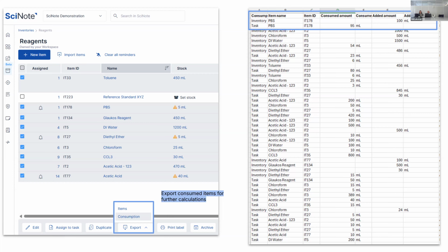No, I completely agree. And this is specifically, I think some of you also answered compliance and audit. This is also something that's important for you with inventories. This is where this comes in, right? If the auditor comes in, you have a snapshot of an item, how much it was used, and the specific state of it. And let's say a due date, right? It's important, for a reagent, until when it was still usable. Expiration date. Expiration date, exactly. No, I agree. This is something great.